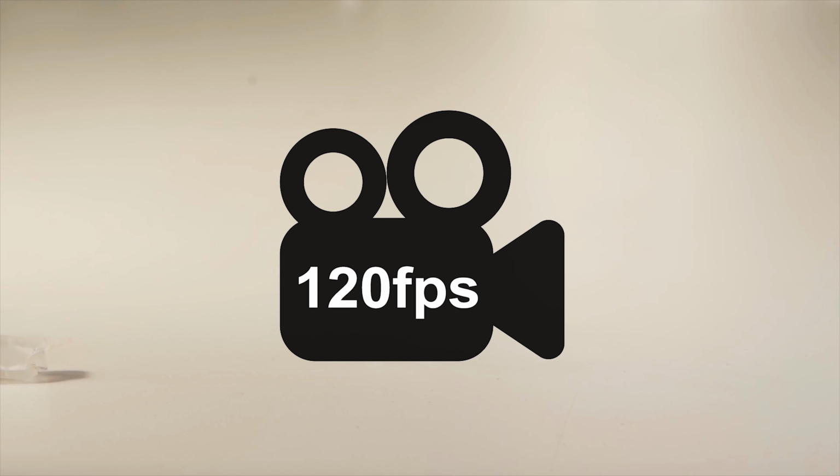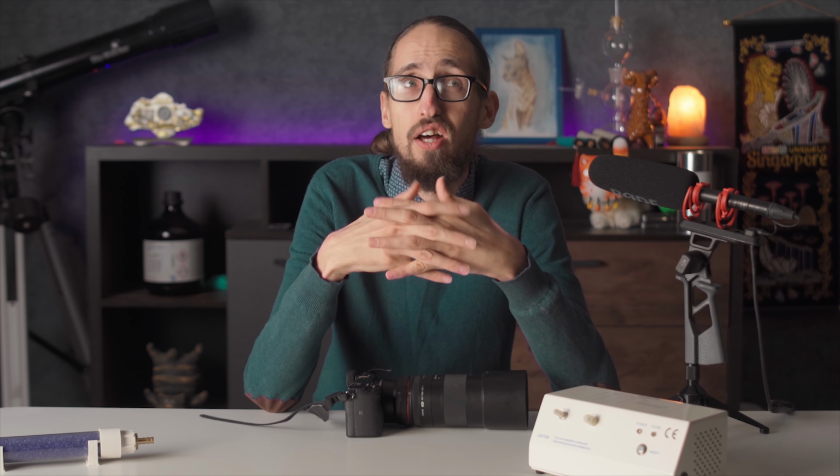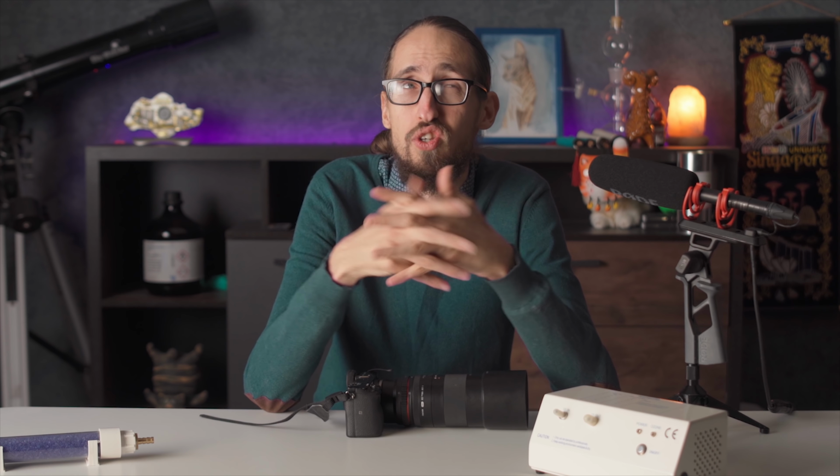Filming at 120 fps, I managed to capture a peculiar frame. The moment the explosion occurred and ozone changed into oxygen, the whole tube got filled with bright light. The change between allotropic modifications followed by a glow is an extremely rare phenomenon in chemistry. Also, antimony might have this ability, but I'm not quite sure.